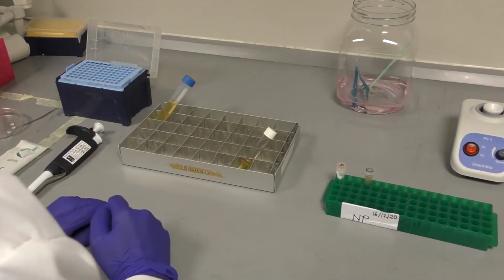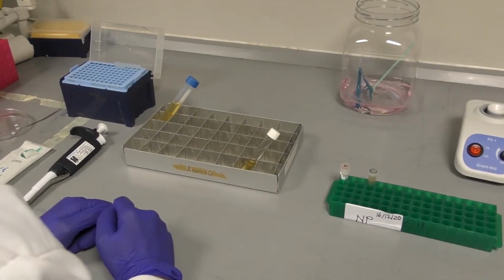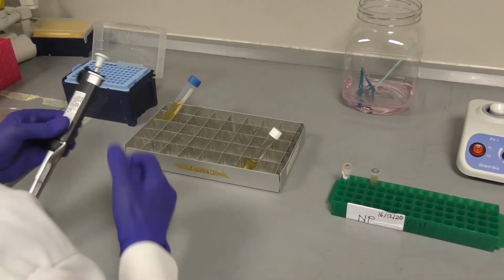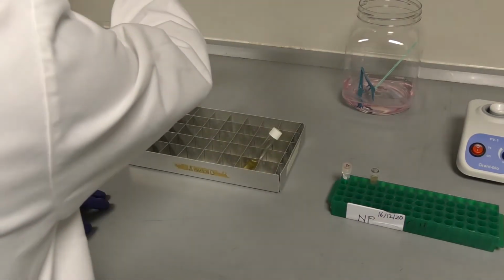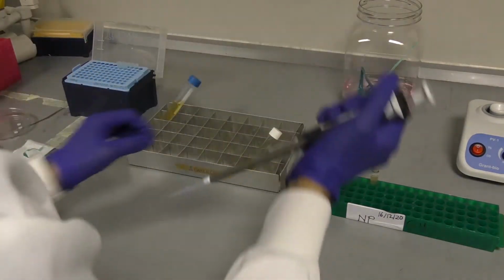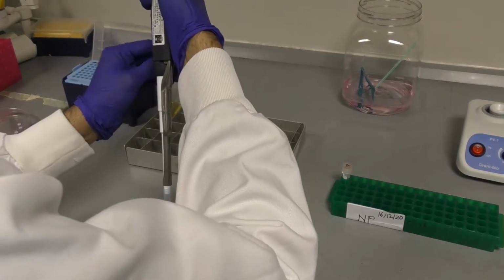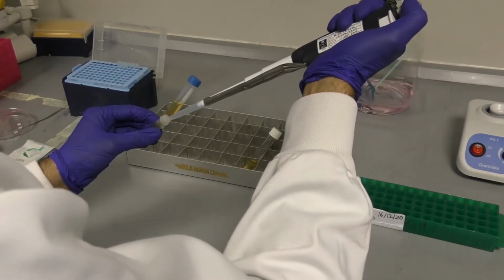We're now going to prepare enough Todd Hewitt broths for the number of specimens you are going to plate. Aseptically, add 1 ml of rabbit or sheep serum to 5 ml of Todd Hewitt broth per specimen and control.